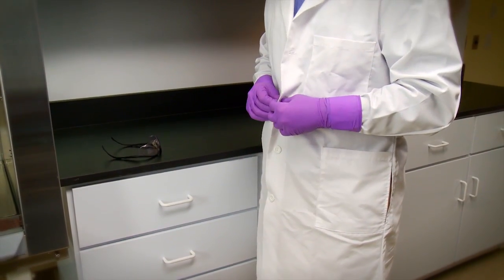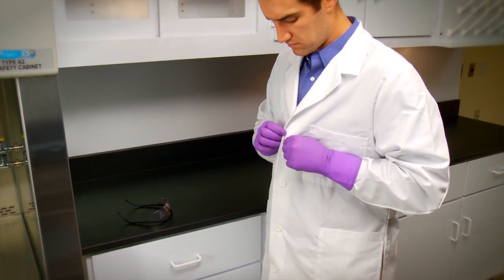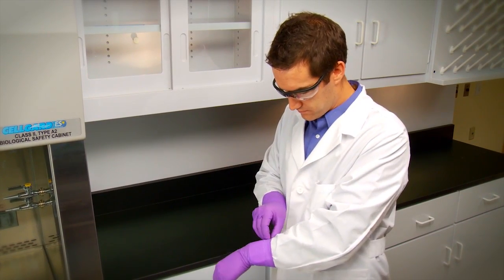Laboratory personnel must receive appropriate training on potential hazards associated with the work involved, including the necessary precautions to prevent exposures and how to react to an exposure.